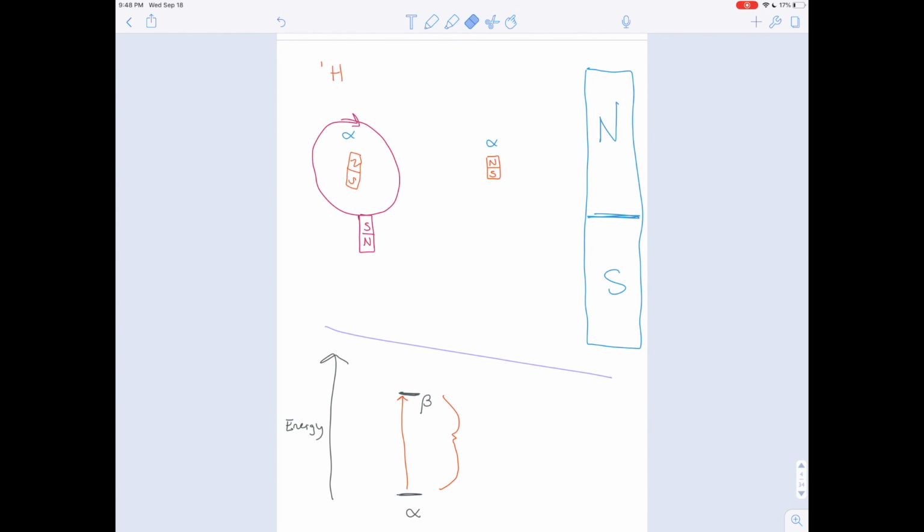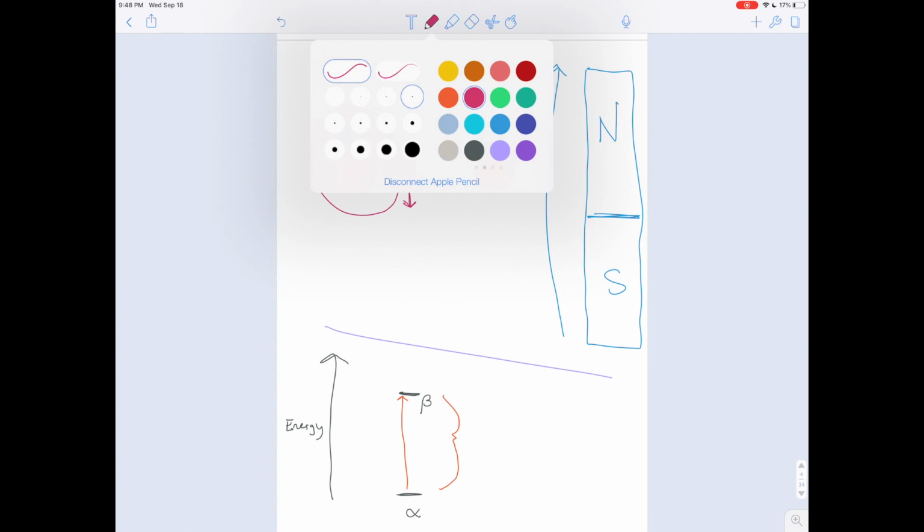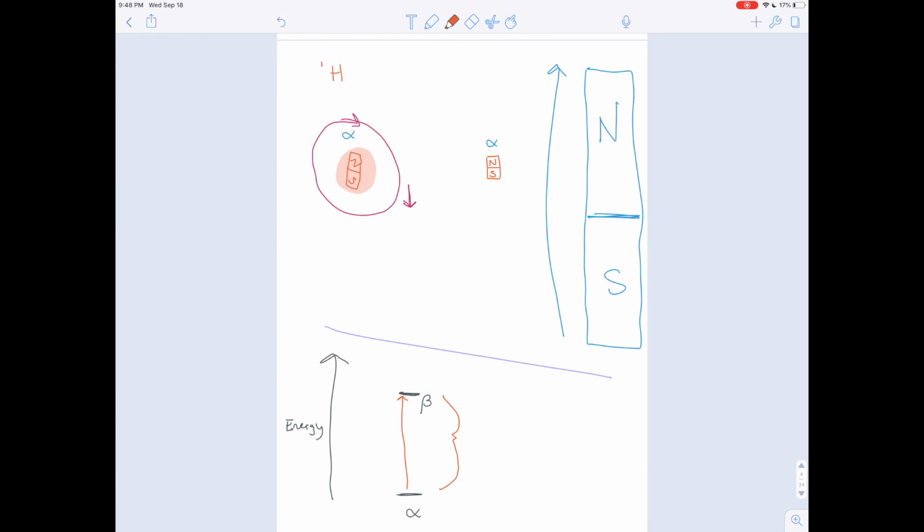external magnetic field. I think this is actually a little clearer if we use arrows. Imagine the external magnetic field being magnetism pushing up. The electrons would fly in such a way as to create their own magnetic field, because whenever charges move, they create magnetic fields. So when these electrons move, they create a magnetic field that opposes the external one, that pushes against it, just like a spring pushes against you when you try to squeeze it or when you stretch it. Okay, now, the key thing to notice here is that the magnetic field felt by the nucleus is the sum of the external magnetic field plus the magnetic field of the electrons that are pushing against it.